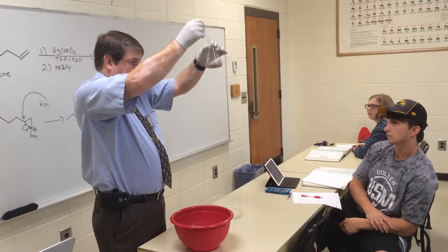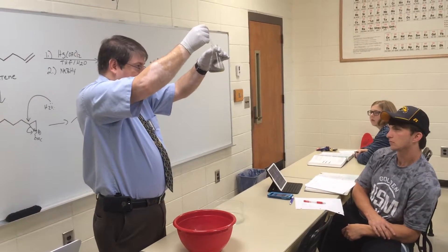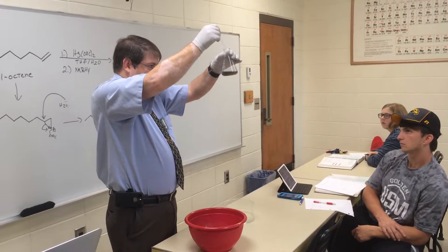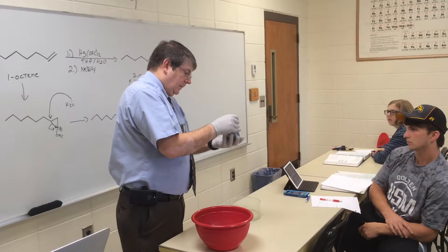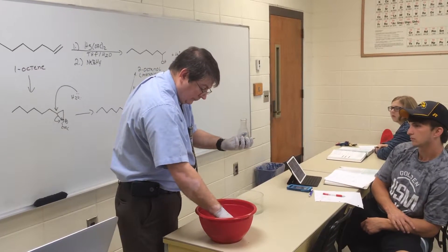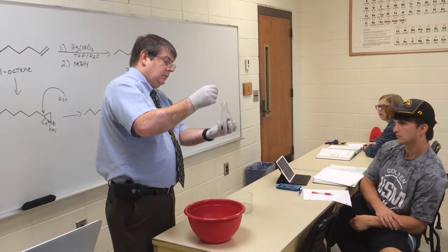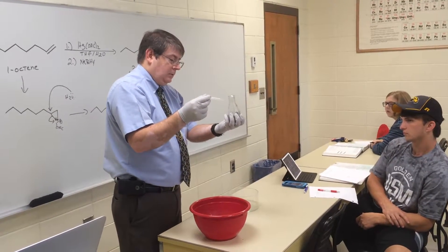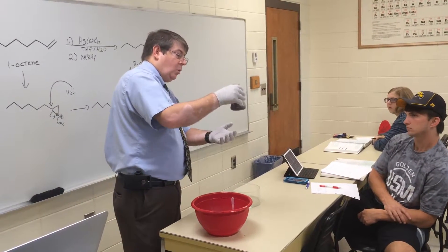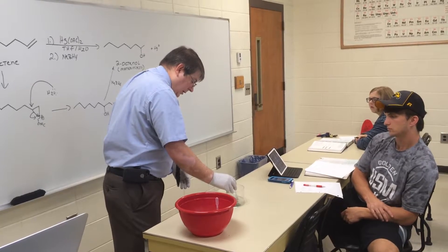See that? What are we forming? We're forming mercury metal. It starts off as extraordinarily tiny beads, so it initially looks like there's rain falling from the solution. You can see it kind of bubbling — it's boiling some of the THF. So I'm going to stick it in a little water bath here and try to cool it down a bit.